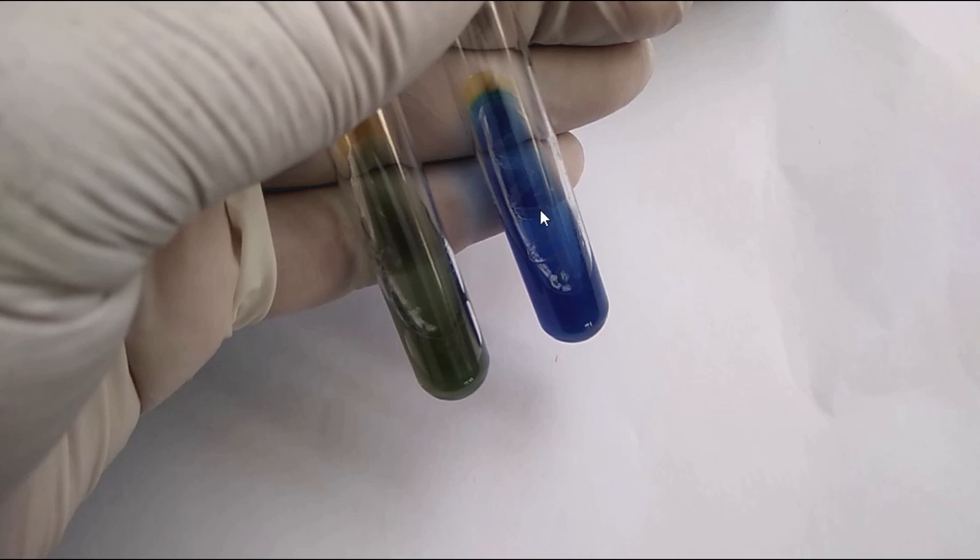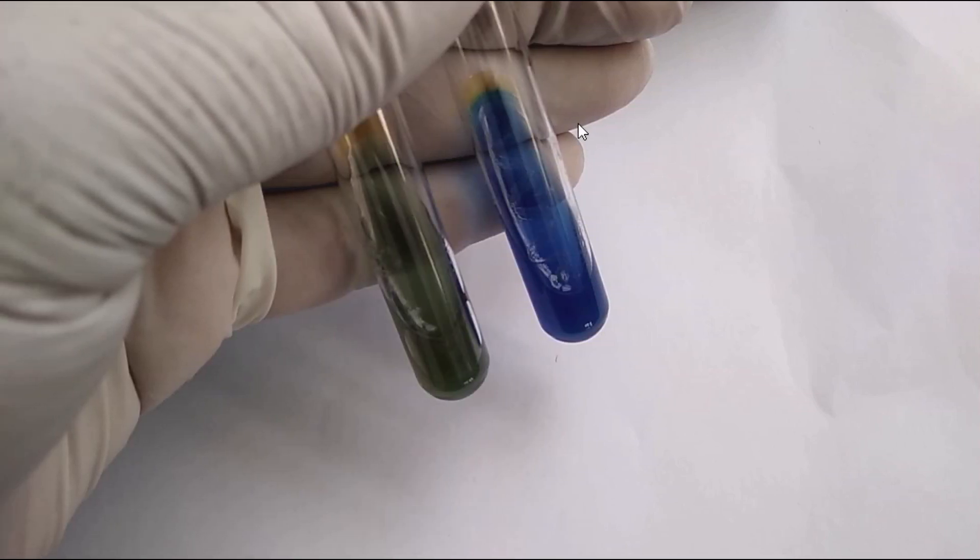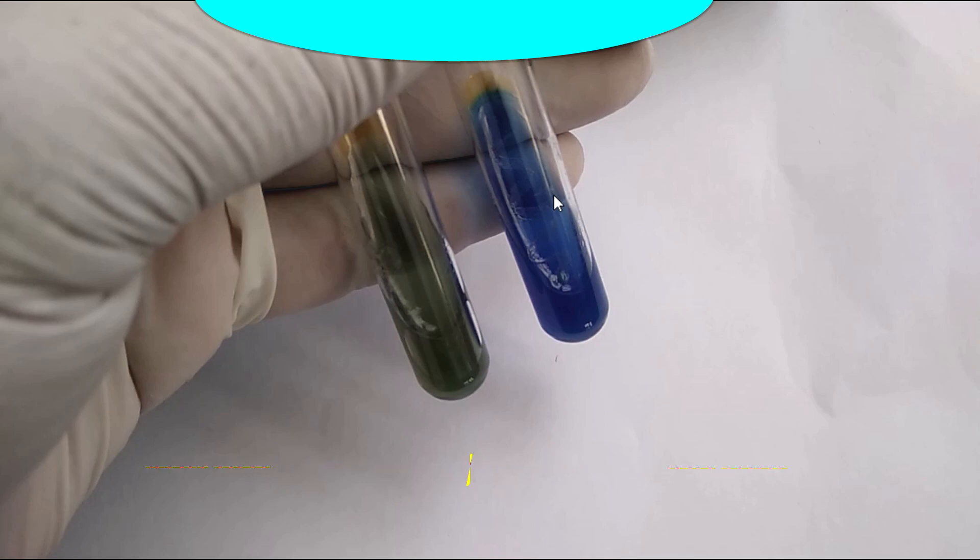To know the exact mechanism: when bacteria metabolize citrate, the ammonium salts are broken down to ammonia, which increases alkalinity. The shift in pH turns the bromothymol blue indicator in the medium from green to blue above pH 7.6. Very simple, isn't it?